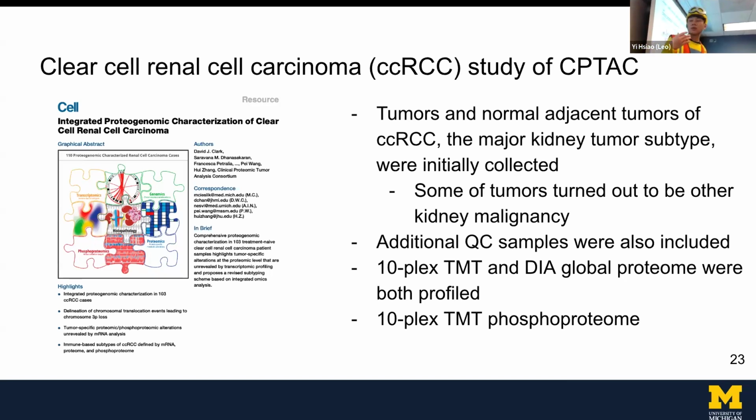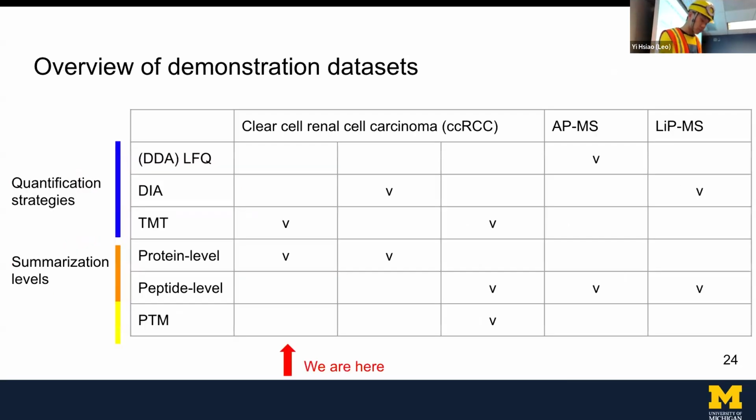I can collect part of the samples in the beginning using DIA, and the rest of the samples will be used to get a higher depth of protein coverage using TMT data. In this workflow, we are also able to profile some PTMs, here phosphorylation. I will start with a basic example.